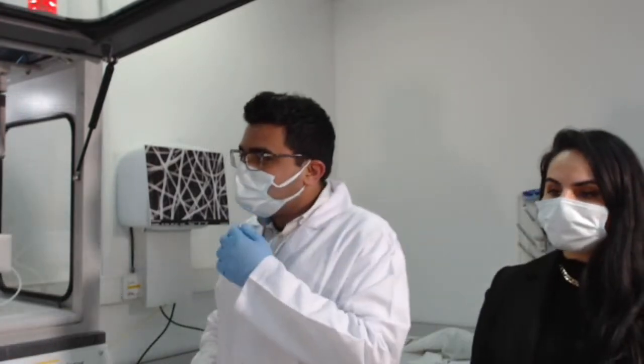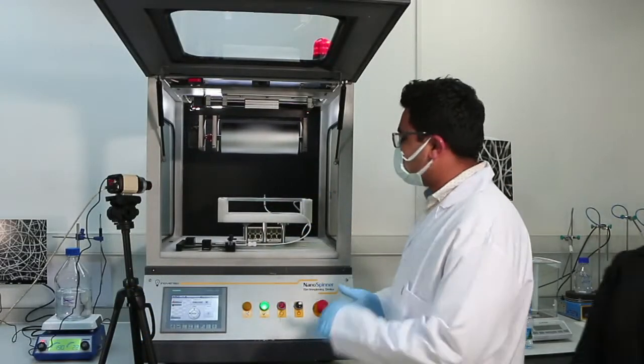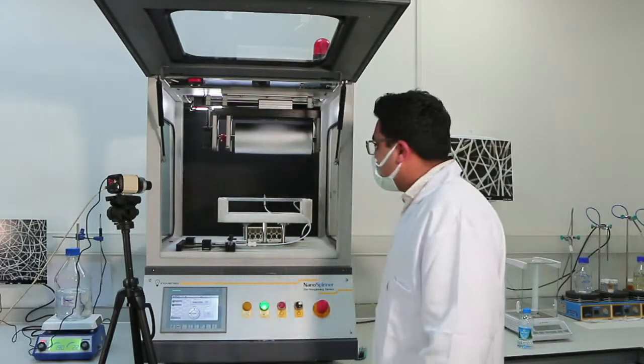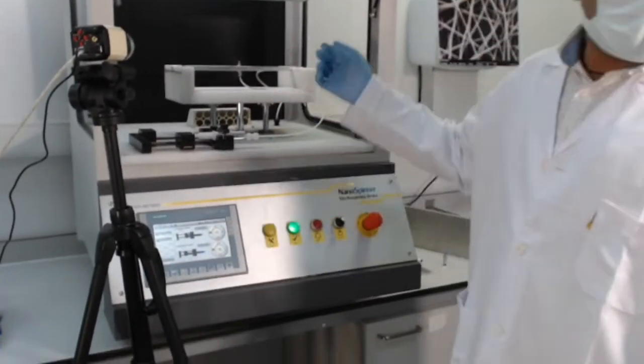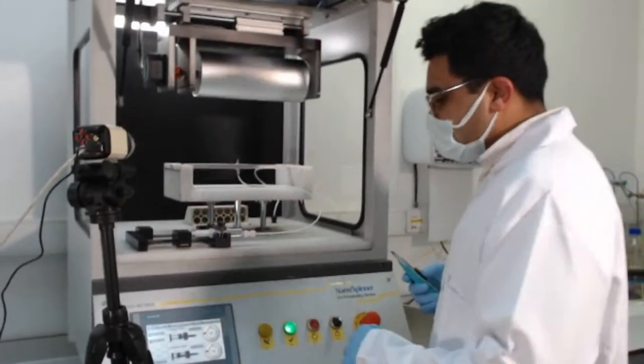All right, let's see. I think we've given the electrospinning process enough time. We can stop it now, so we can just press pause. This will cut the voltage, the spinning and the rotation, everything. So let's take out the sample and show it to you.